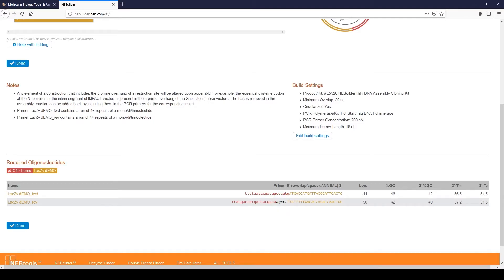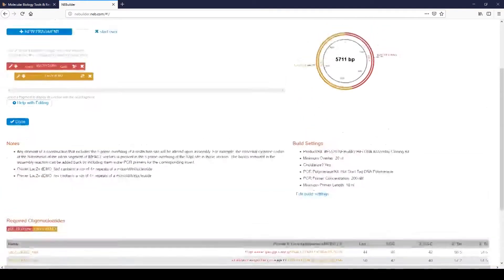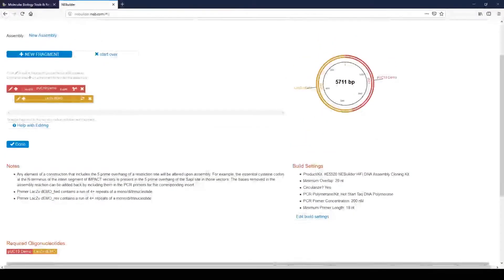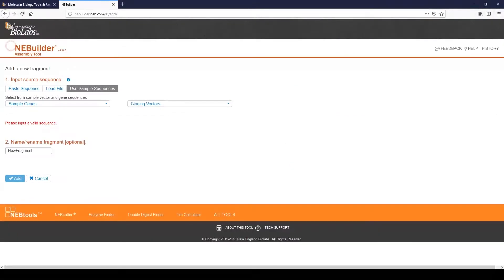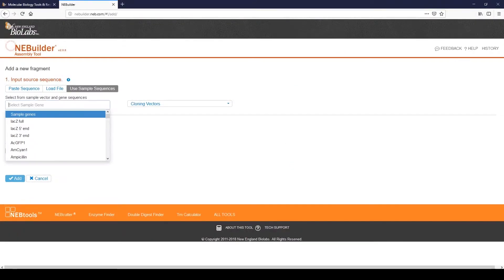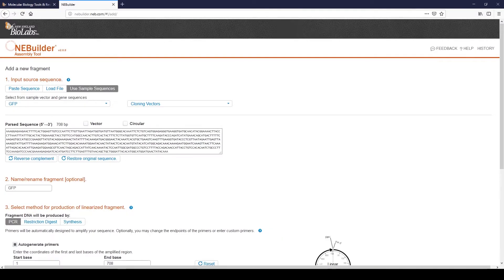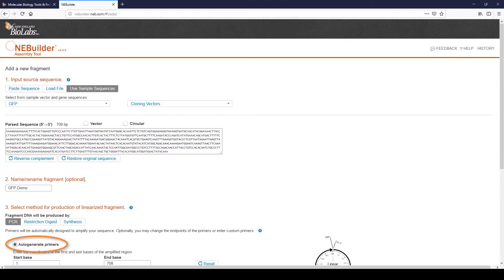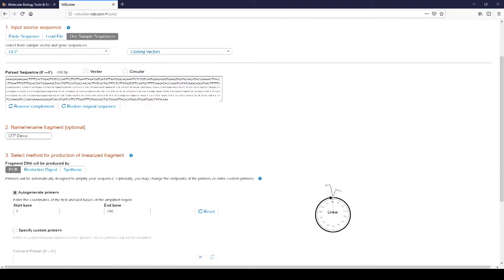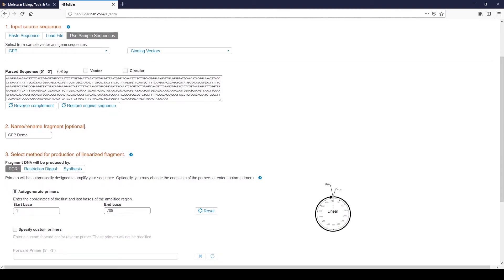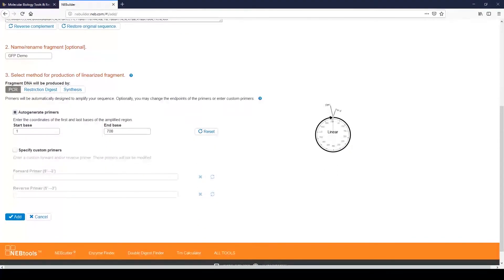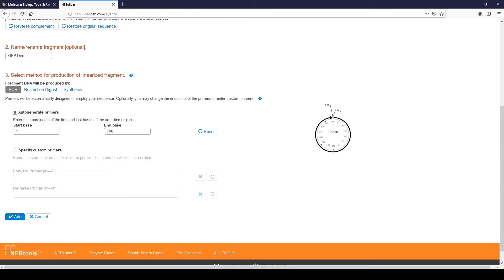Now, let's add another fragment. Click Plus New Fragment. We will use another sample sequence. Select GFP from the drop-down menu. Name the fragment. Select PCR as the production method. Be sure that Auto-Generate Primers is selected. Enter the start and end bases. In this case, we will use the entire sequence. Click Add.